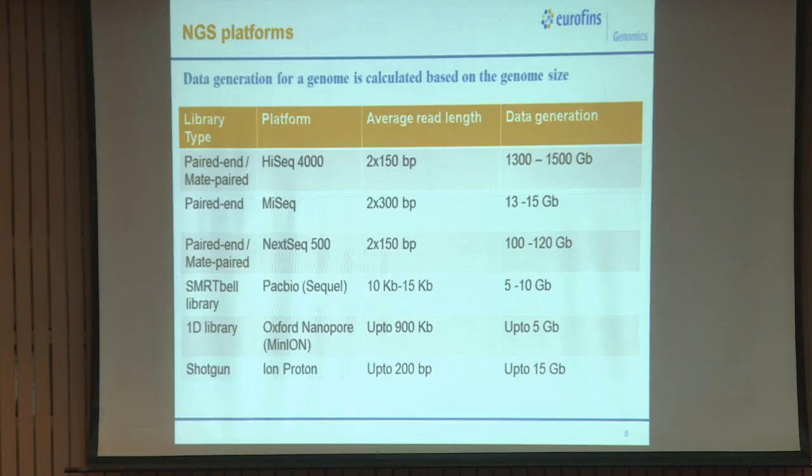Chemistries with different read lengths. We have only talked about Illumina chemistry at present. I will go in brief on the other chemistries as well. So, we spoke about paired end and mate pair of Illumina.